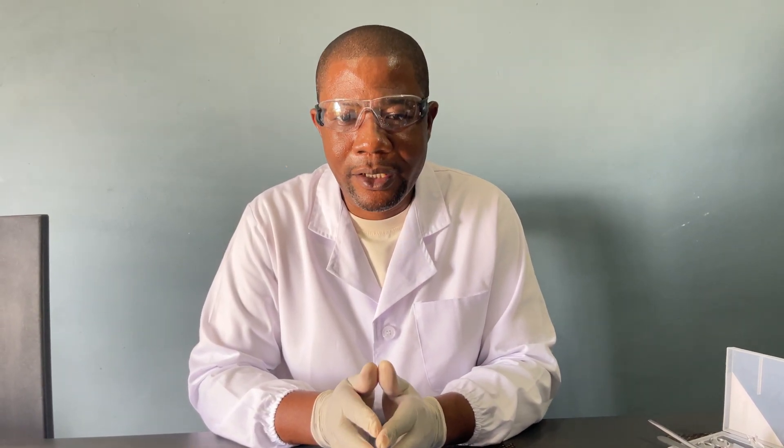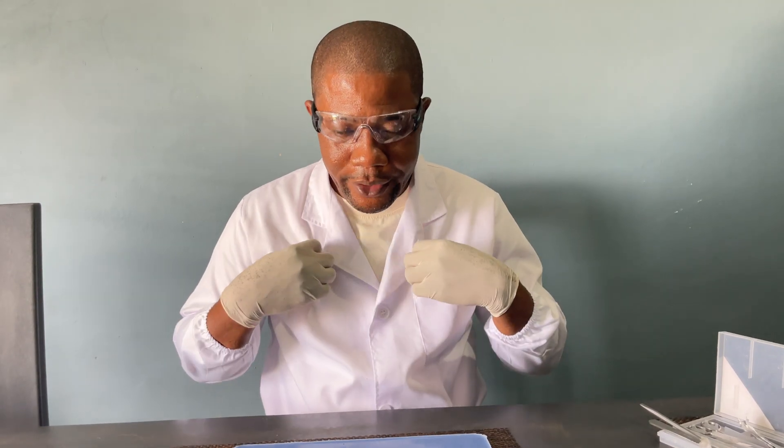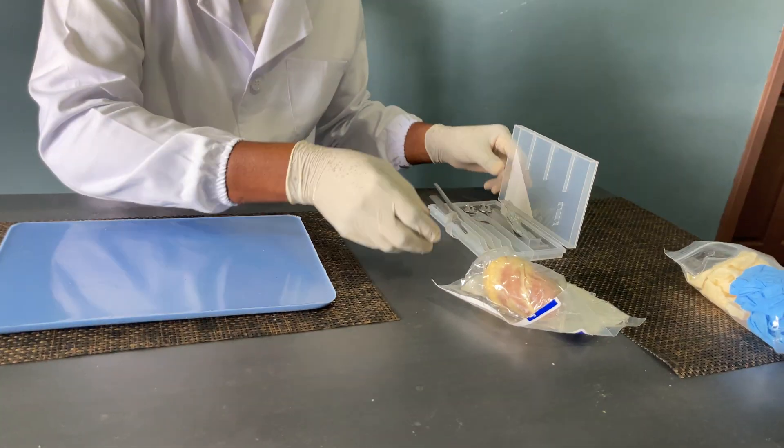Welcome to the discussion of sheep hearts. Before we start our discussion, we need to observe our safety protocols. I have my PPEs done: I have my gloves, I have my apron, I have my goggles. Then we need to have our items, so I have my dissection tray, I have my dissection kit.